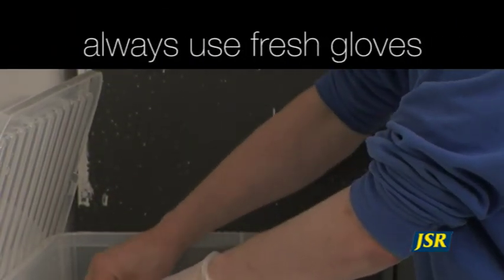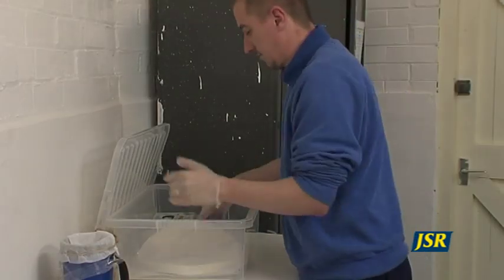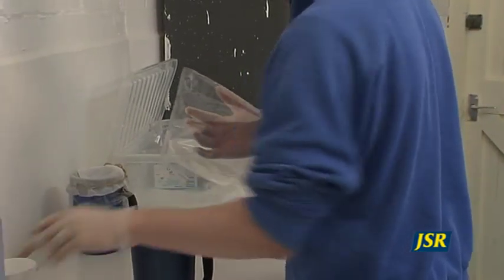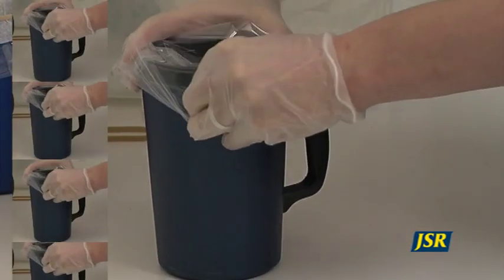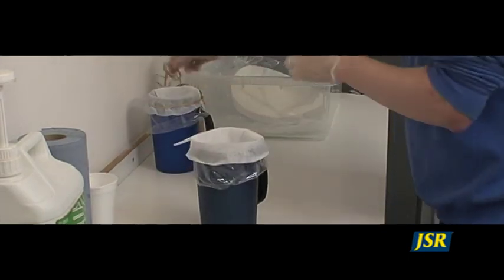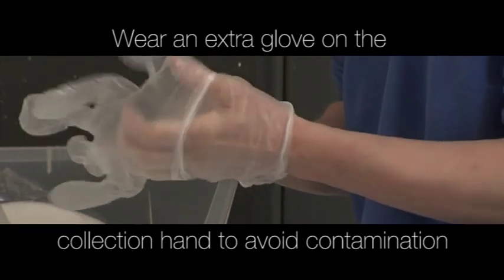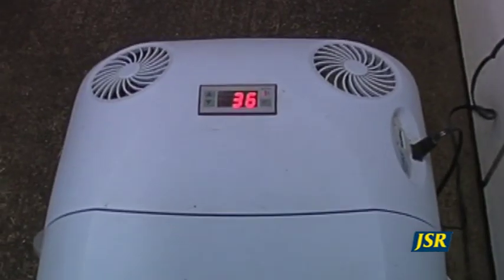To prepare a clean collection flask, first put on a new pair of semen-friendly gloves. Depending on your preferred method, prepare a plastic collection bag or polystyrene cup with a semen filter and collection flask. Use a new elastic band to secure the filter. Put a plastic glove over the hand you will use to stimulate the boar to protect the collection glove from contamination. Store this flask in a warm box at 36 degrees centigrade to reduce the possibility of cold shock to the semen. You are now ready for collection.